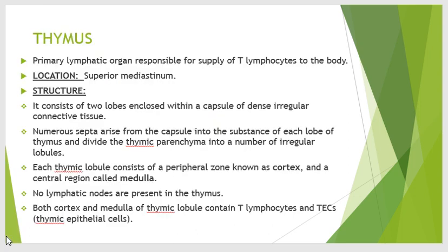Today the topic of histology practical is thymus. Thymus is a primary lymphatic organ which is responsible for supply of T lymphocytes to the body. It is located in the superior mediastinum.